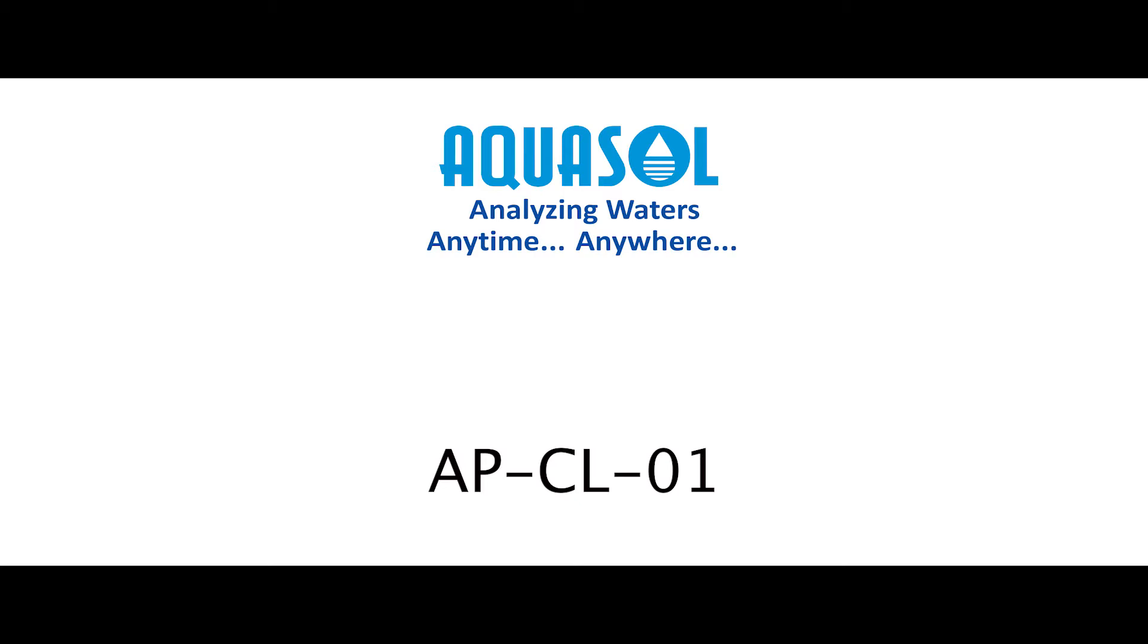APCl01. This is a portable meter to test the free and total chlorine.